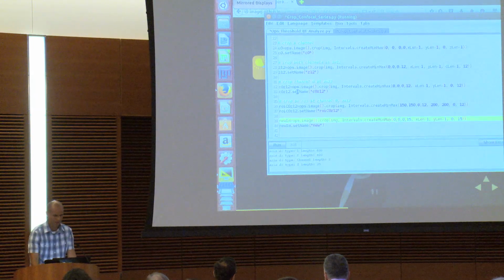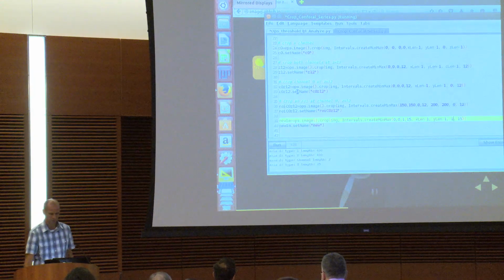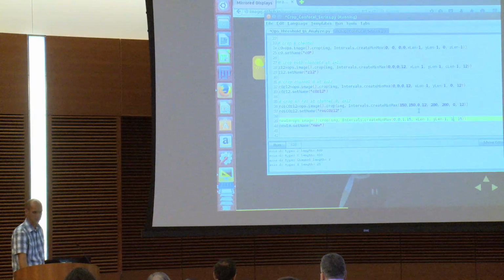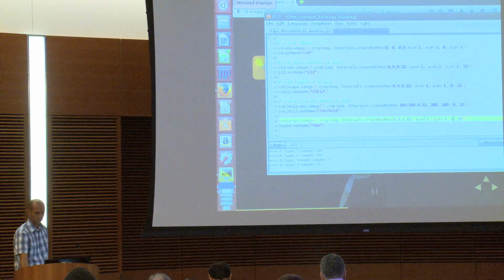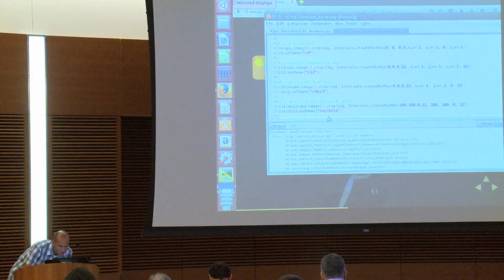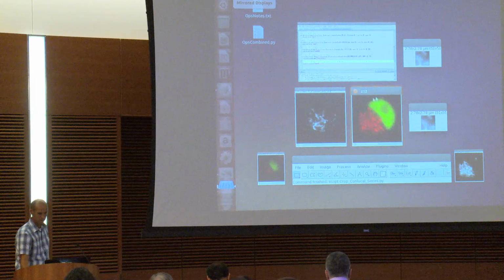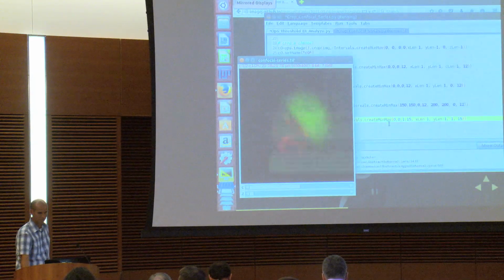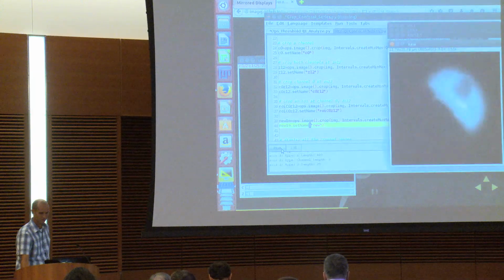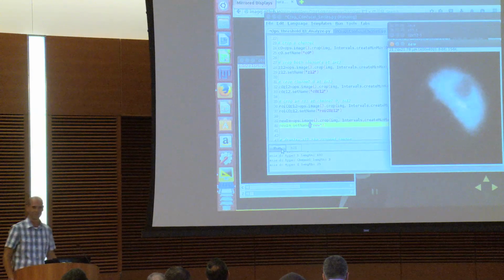So anyway, in this little example here, we know the organization of the data. So we change this code here to crop out channel 2 and slice 15. And if we run it, okay. So what happened? What happened there is the active image changed, and it didn't have all the dimensions that my poorly written script was expecting.